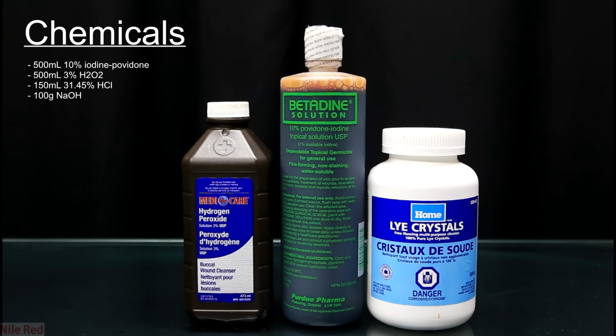These are the main ingredients that I used for this experiment. I made a mistake and I forgot to include hydrochloric acid in this shot, so we're going to have to just pretend that it's there. I used 500 milliliters of 10% iodine-povidone solution, but the amounts of the other reagents don't have to be really exact. I would make sure to have at least 100 grams of sodium hydroxide, 500 milliliters of 3% hydrogen peroxide, and about 150 milliliters of around 31.45% hydrochloric acid.